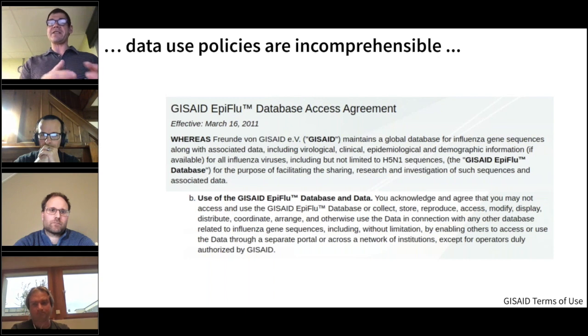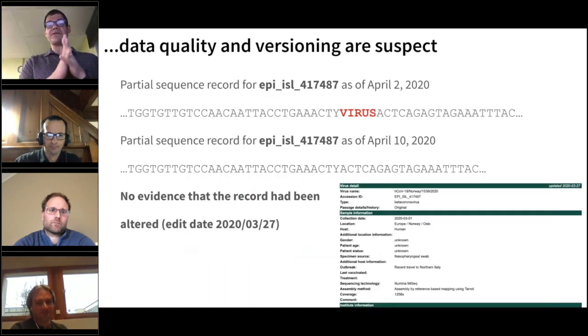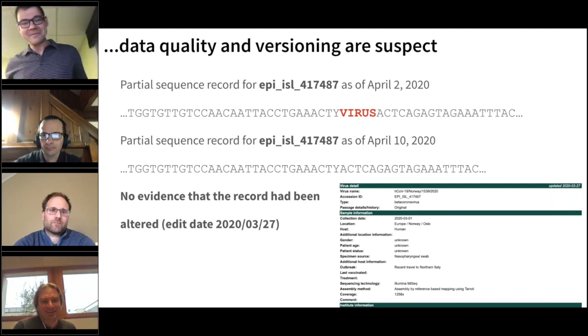And the open databases, for example, GenBank or whatever NCBI runs, have only a subset of these 12,000 complete genomes. And this is a wonderful example. Sergei, maybe go ahead, describe that.